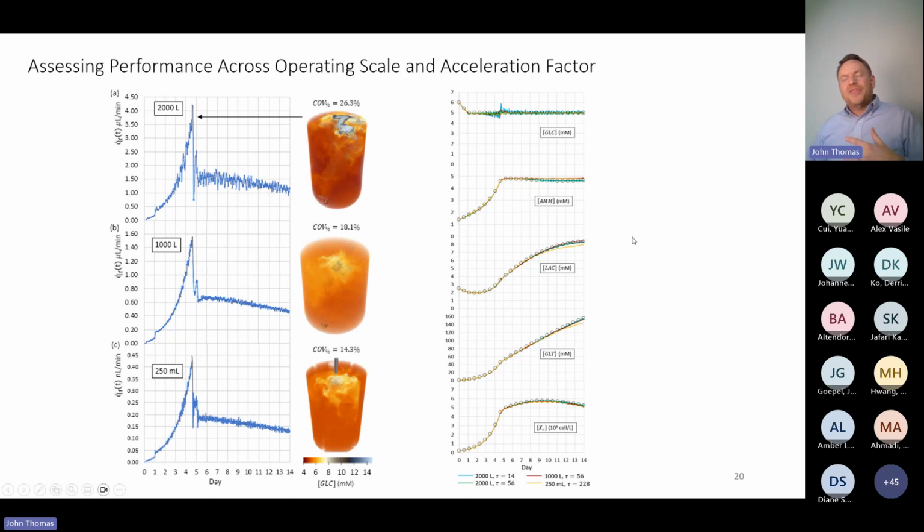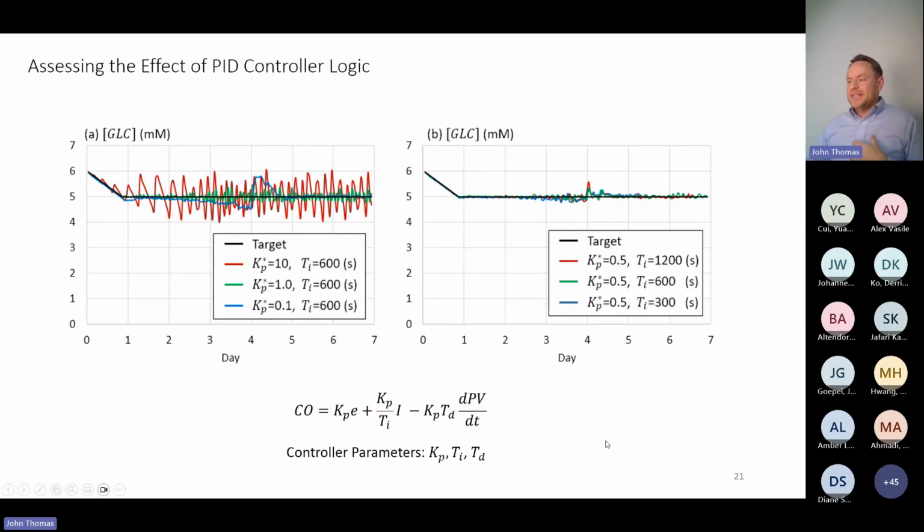And so it really seems to corroborate that I do have a degree of freedom here to make these simulations run faster, by accelerating the time at which these cells grow. And again, I can see this numerical trick. We're actually just magically making these cells do their thing 10 times faster, 14 times faster. But the savings to us is the code can run in 2 days as opposed to 30, right? If we can take advantage of these scalings, and apparently with no loss in fidelity. And again, just to reemphasize this point, beyond just looking at cell growth, beyond looking at operating conditions, I can tune feedback control or whatnot.